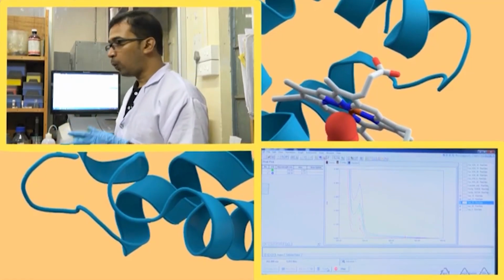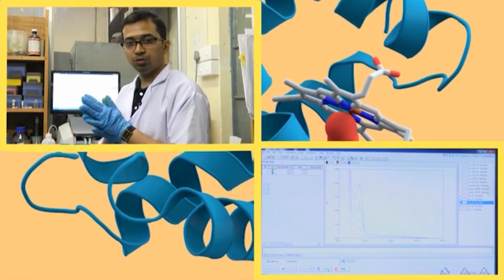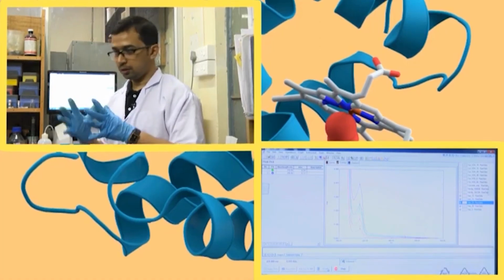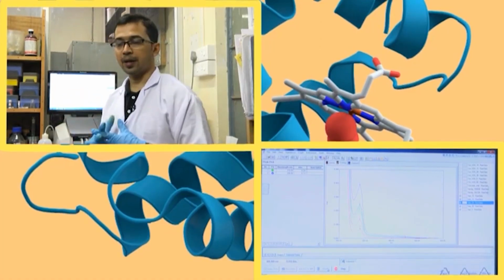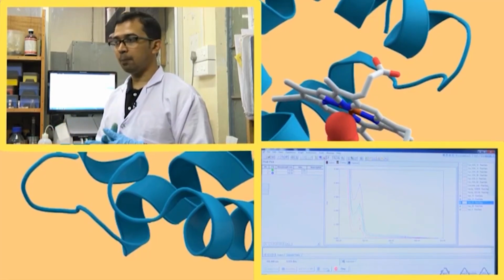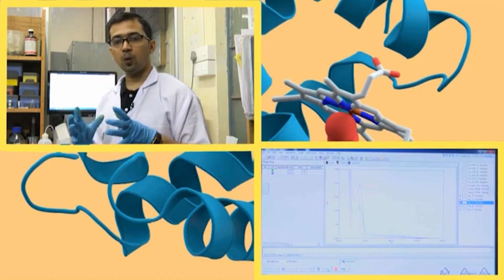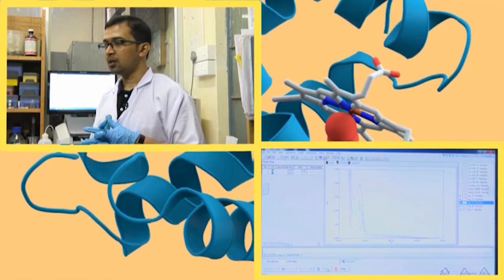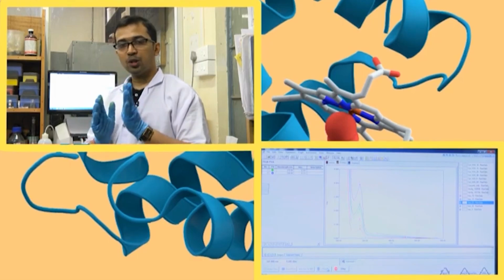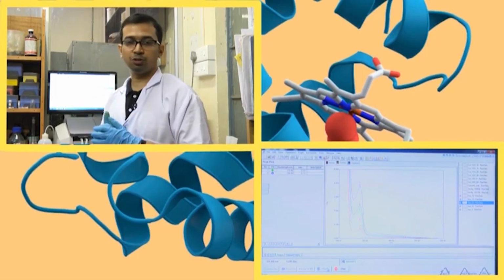So, why do we require the final concentration? Now, how to analyze this spectrum, or this interaction? If you get into the theoretical part, there is an equation called the Benesi-Hildebrand plot. In easier terms, we have to plot the absorbance versus concentration.